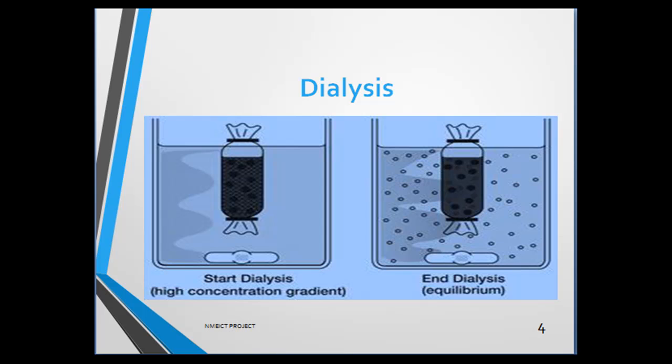Dialysis is based on diffusion of molecules in solution from higher to lower concentration until equilibrium is reached. Movement of molecules across the membrane will be based on the membrane cutoff. Larger molecules cannot pass through the dialysis bag and will be retained inside the chamber. In contrast, small molecules will freely diffuse across the membrane and reach equilibrium across the entire solution volume, thus effectively reducing the concentration of those small molecules within the sample.